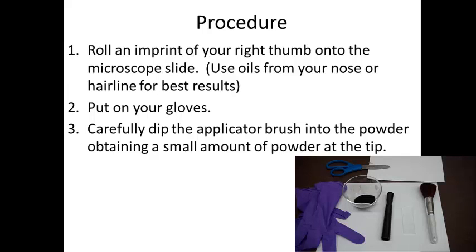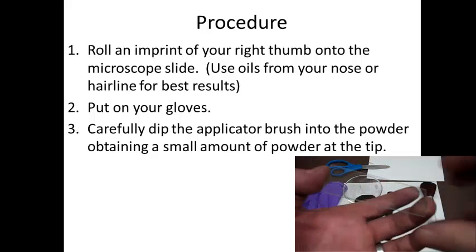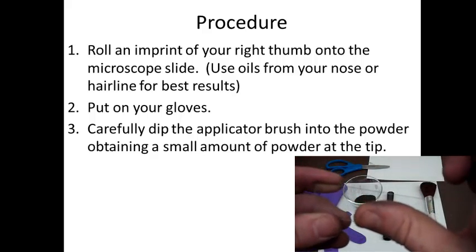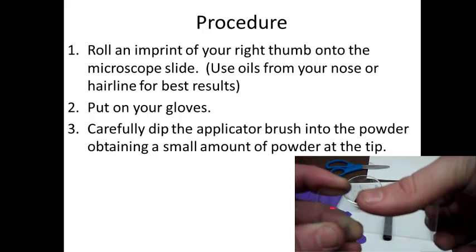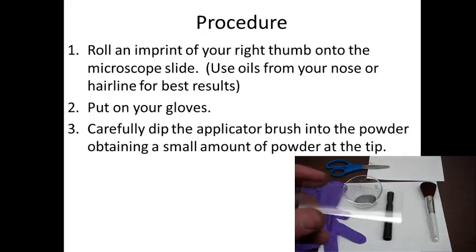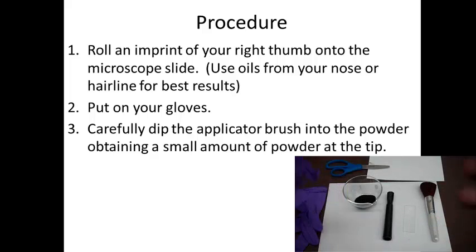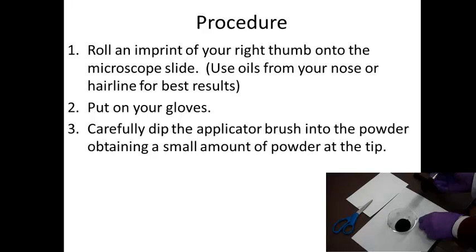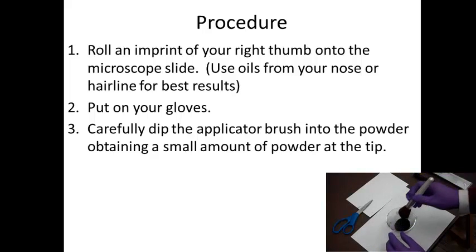How are we going to do it? You're going to go ahead and grab your microscope slide and roll an imprint of your right thumb onto it. For best results, you can use the oils from your nose or from your hairline and roll it — you'll actually be able to see it pretty well. Then you're going to want to put on your gloves. A lot of students put their gloves on first and go, oh man, I have to make a fingerprint. So put your gloves on second, and then carefully dip the applicator brush into the powder and just get a little bit at the tip of the applicator brush.